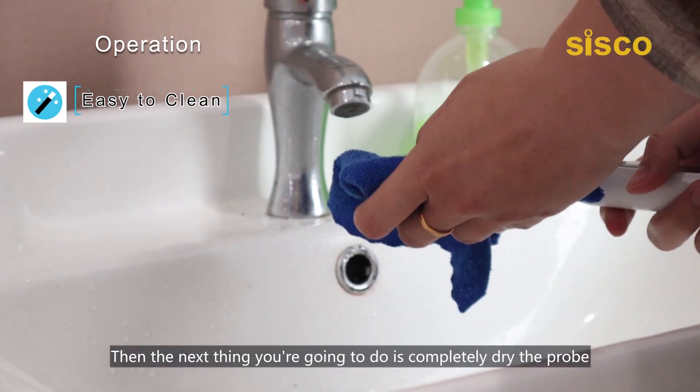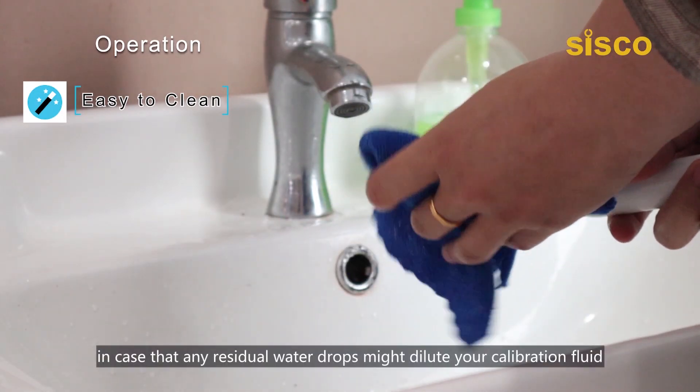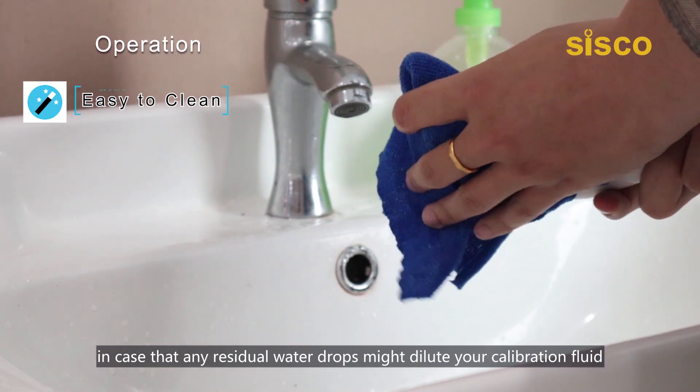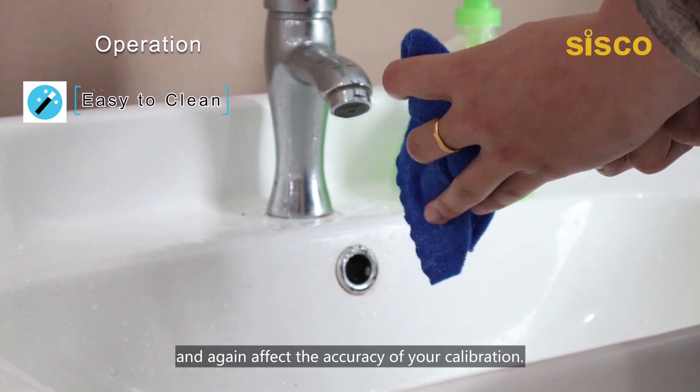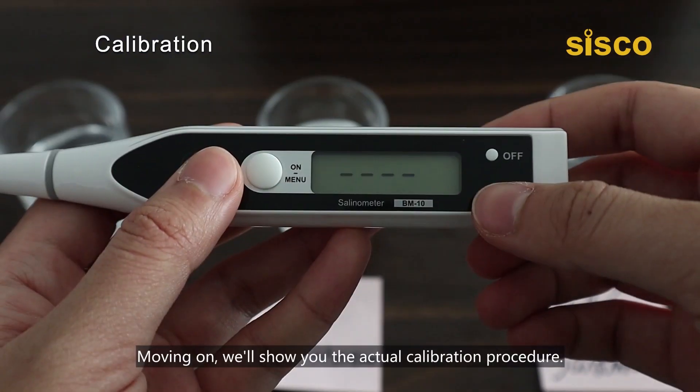Then the next thing you're going to do is completely dry the probe in case that any residue water drops might dilute your calibration fluid and again affect the accuracy of your calibration. Moving on, we'll show you the actual calibration procedure.